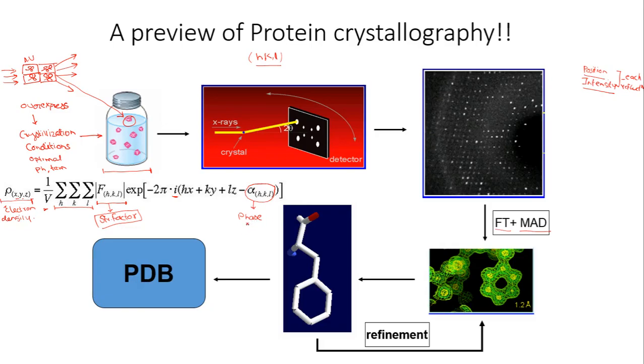Practically, what happens is that the biophysicist gives the position and intensity to some computer program, and eventually it generates the electron density map. This is what happens at the theoretical level in the background. I thought it would be better for you to know what the structure factor is, what phases are, and what the phase problem in crystallography is.